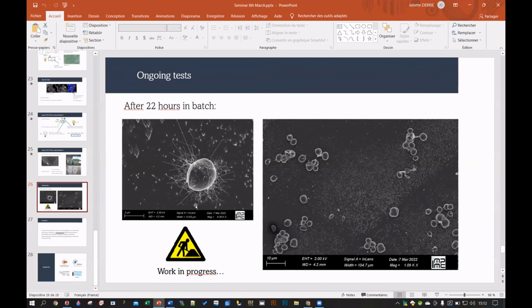Usually the way people describe the formation of biofilms, the first interaction is electrostatic, and then you start binding with the EPS. And I think those fibers that are sticking are mainly like that. We also saw the same in the aquaria on some diatoms: we could see diatoms sticking to surfaces with those fibers.